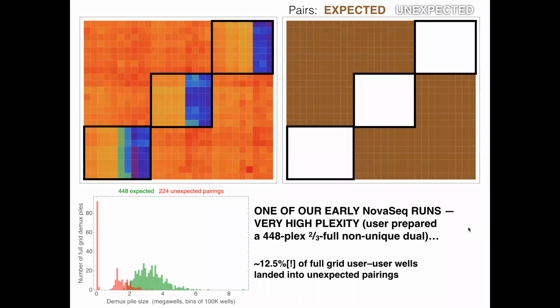So this was a case where there was actually stuff we could do. It turned out that the prep needed to be worked on, which you can kind of guess because this shows a block structure, right? Something is happening related to it. It's not just an all-versus-all. So indeed, there was a way to clean up the prep a little, and we made this problem more than 10-fold less of a problem, maybe even 100-fold less of a problem, with some tweaks to the prep.